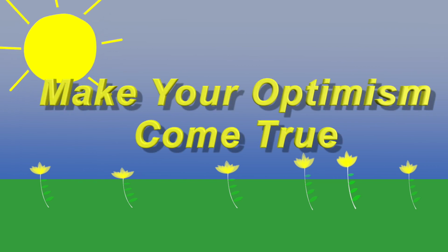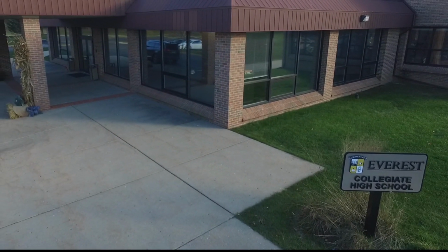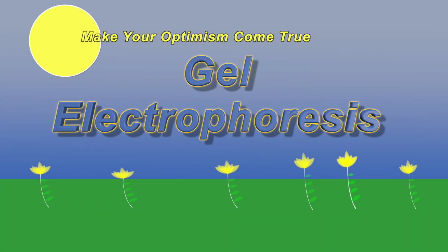On this episode, we'll be visiting Clarkston Everest Collegiate High School to learn about equipment purchased for their science program for a process known as gel electrophoresis.